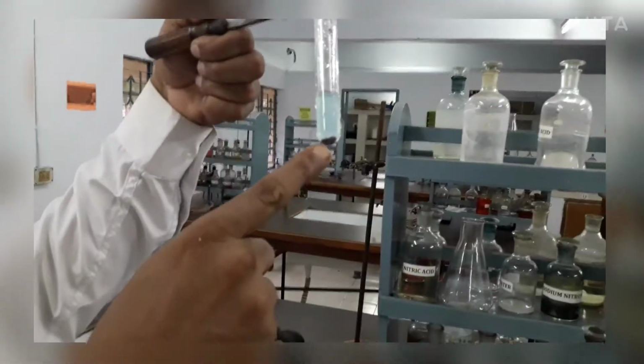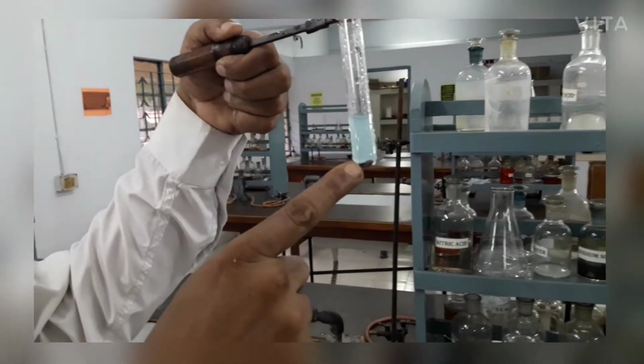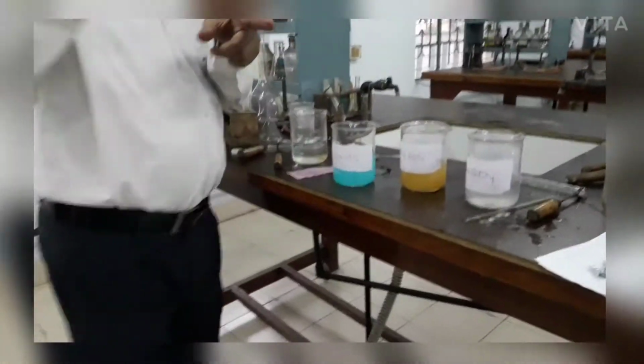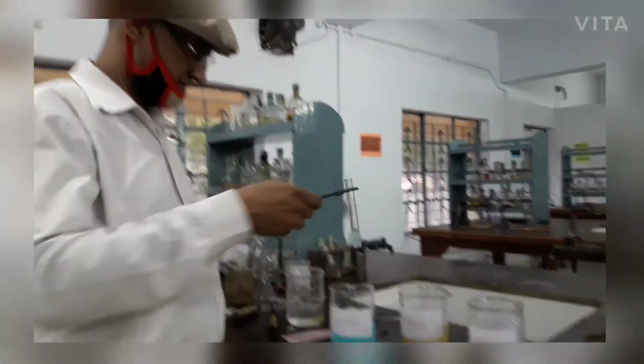And we see that a reaction occurred. Iron becomes reddish brown. This iron is more reactive than copper, and this solution is iron sulfate. So here iron is more reactive than copper, so reaction observed.